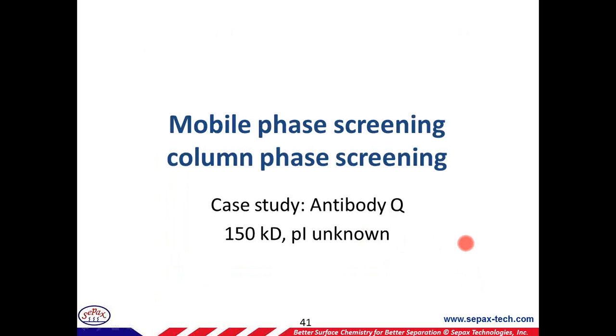Okay. So we have talked about the particle sizes and also this column comparison. Next, we're going to do a case study. With an antibody, we only know the molecular weight, but we don't have the other information from our collaborator.